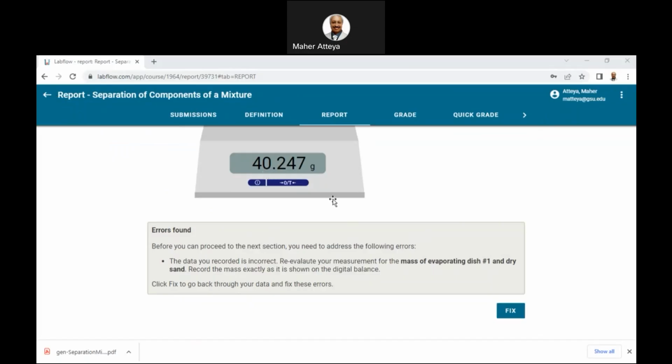And if you can look, it said copy, and we are copying it here. You paste it here. And you know the error came with the blue. So the blue here, 6282. So this is the blue one here. So let's fix it and see what will happen. Let's see, fix.